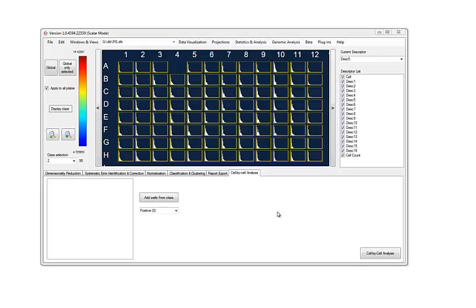During the first two chapters, we saw how to import and create a database. Then we saw how to visualize the database and how to visualize the data that are coming from a cell-by-cell analysis. And now we will see how to proceed in order to extract information and to perform a classification on a cell-by-cell basis. So, as you remember, all those wells contain many different cells.